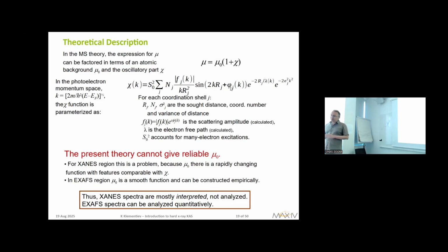The meaning of every theory is to calculate these two functions, the amplitude function and the scattering phase. We don't know them yet, so either we calculate them or find them somehow experimentally. And I will also show an example for this.